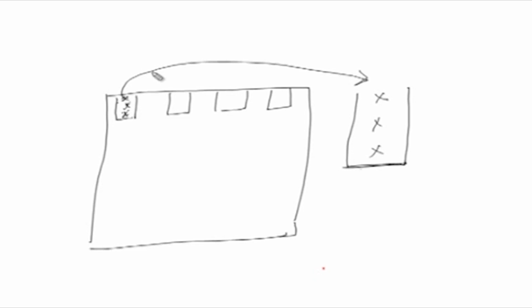Now, obviously, when you have dilute solutions, where the amount of sample you have taken is a large volume, then since your analyte or molecule is distributed all over, the molecule closest to the gel interface will enter first, and will also move somewhat on application of the electric field. But the molecule of the same analyte will have a time gap when it enters relative to the first one. If I say this is number 1 and this is number 2, then number 1 will move somewhere, then number 2 will enter in here.